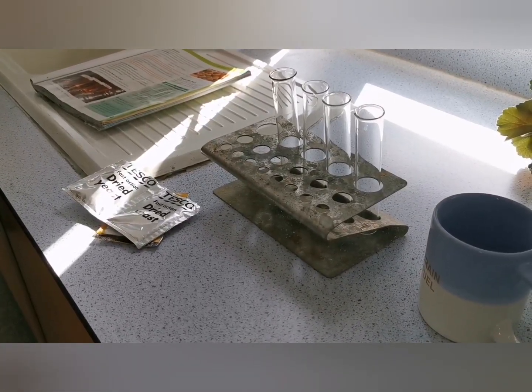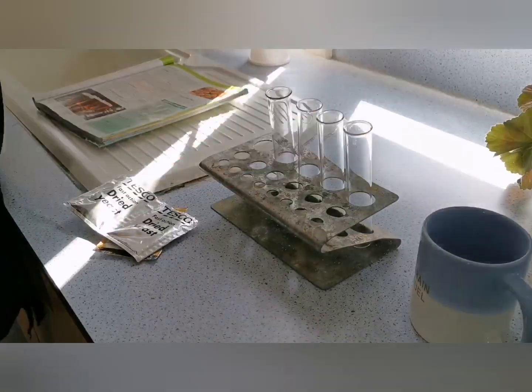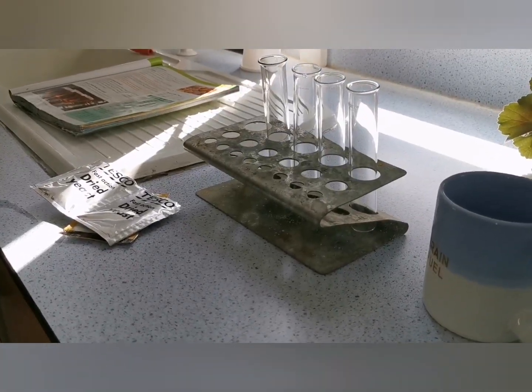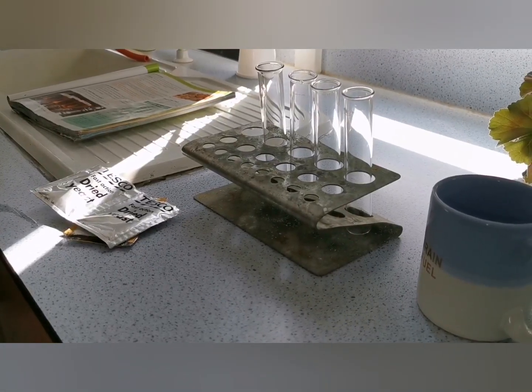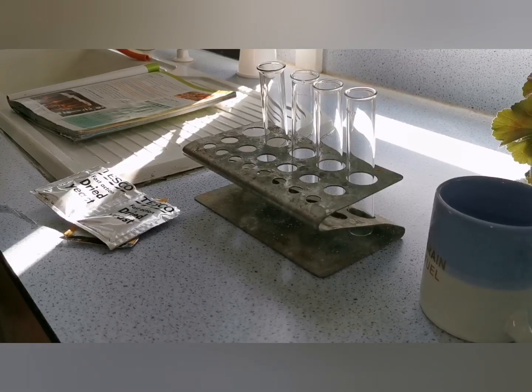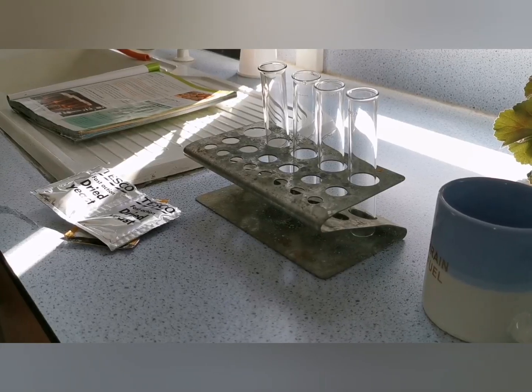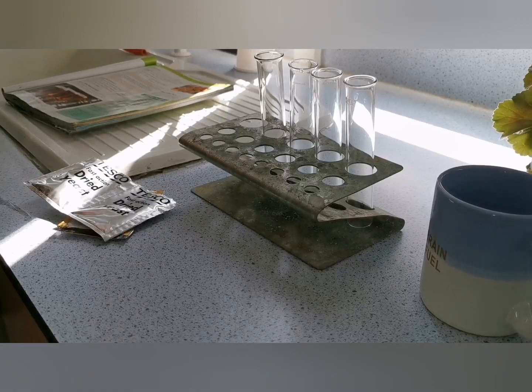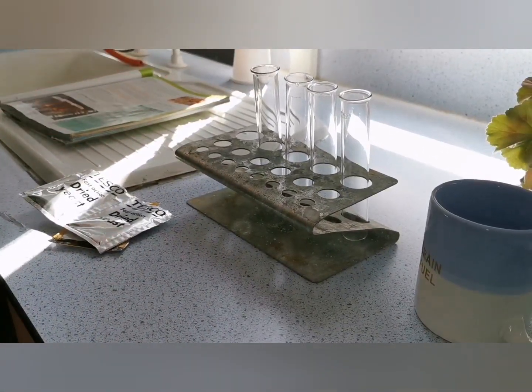So we're going to do a little test today. We've got 4 test tubes here. We're going to put yeast in each of these, some water in each of these, and some sugar, so it's got something to have a little munch on. We are then going to prove that it produces carbon dioxide, so it should be very bubbly, giving off bubbles of carbon dioxide. We call that effervescing, so anyone in my class knows the word effervesce, that means bubbles. And we're going to try it in different temperatures to see which temperature the yeast likes. Does it like hot? Does it like cold?